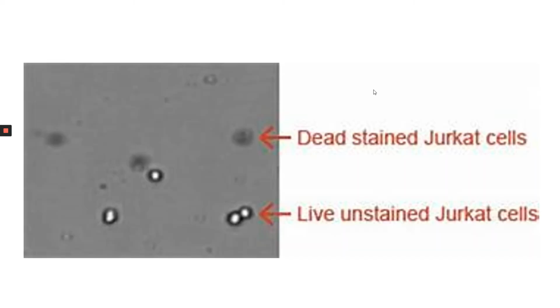So one issue in microscopy is that dead and living cells can appear identical when viewed. Vital staining is the technique we use to count the number of viable living cells. One type of vital staining shown here is actively excluded from living cells. So when it diffuses into the cell, if the cells are alive, they will be able to push it out. That means we can count those that are clear as the living cells, and we can see here cells that have not been able to excrete the stain. So those ones are probably dead.